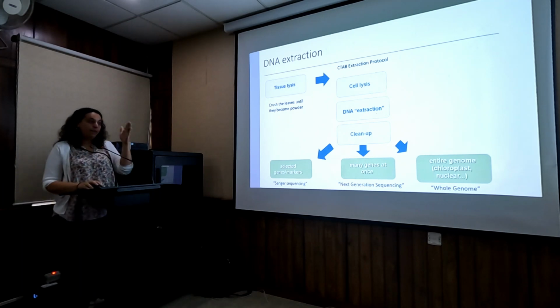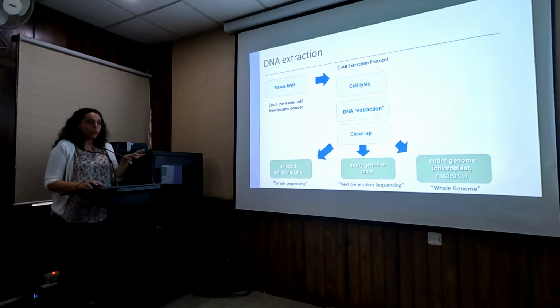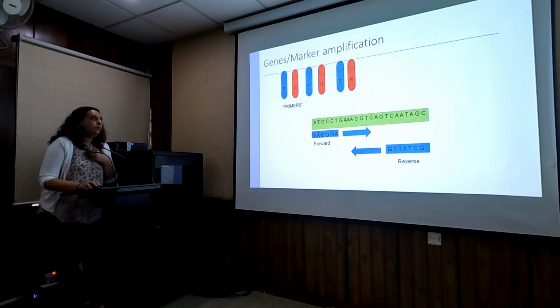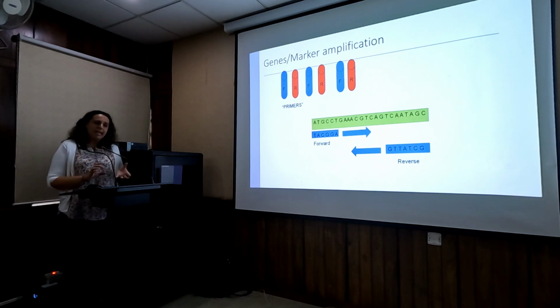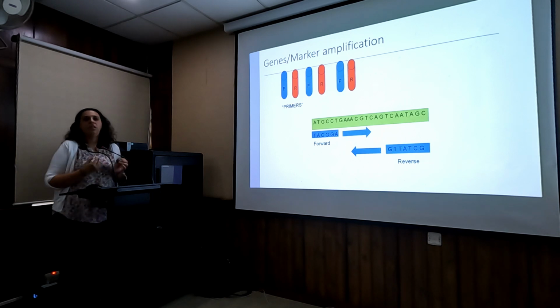But okay, so this is kind of the three different methods in a very general way that you can use for your project, according to your resources, according to your question. So the Sanger sequencing and the next generation sequencing, they have kind of a similar structure in the way the methods work. So if I go quickly through the Sanger sequencing, you'll easily understand the next generation as well.